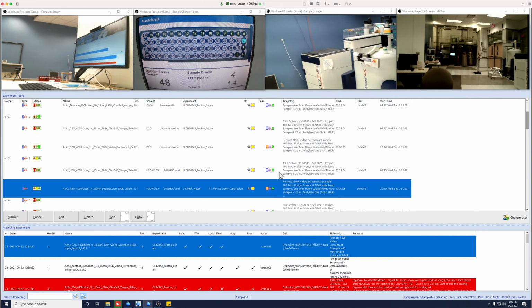So now you can log out after you've set up all the experiments, and the data will be on the cloud accessible for you. Again, there are separate videos to talk about processing data, which can be done completely offline. If there are any problems with collecting the data or getting a sense for how long it's going to take, usually things are run within several hours of queuing them up. But obviously it depends on how many samples and what has been queued up.